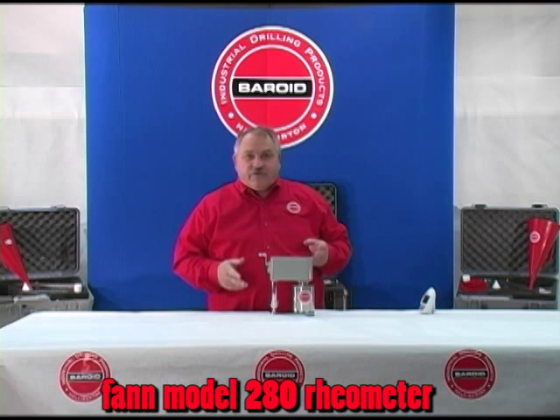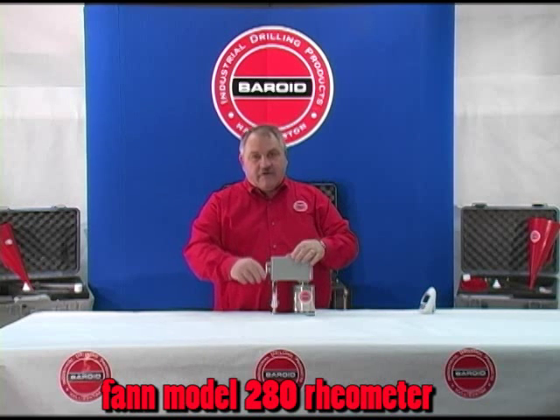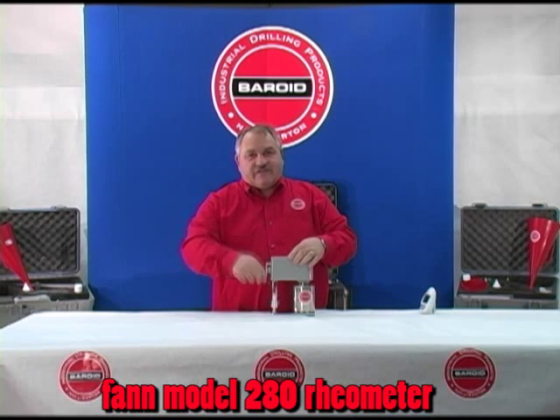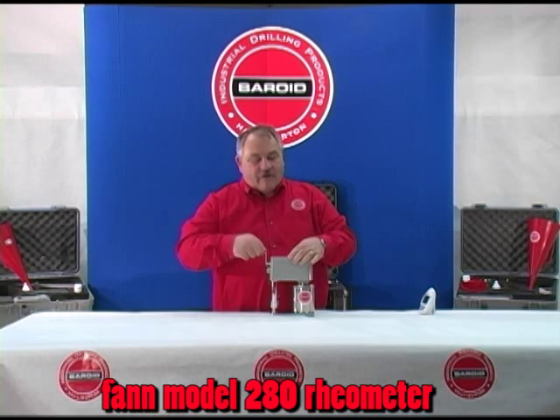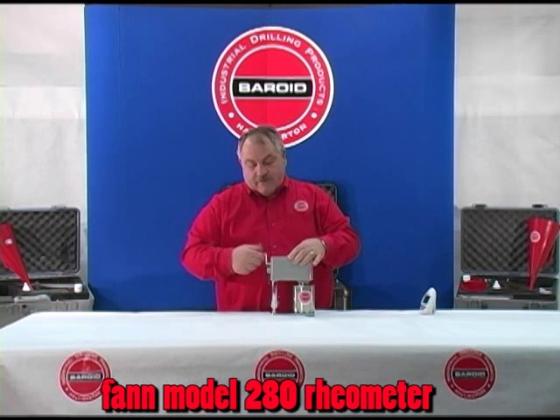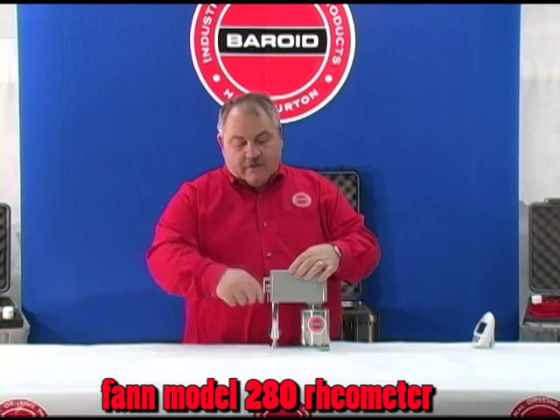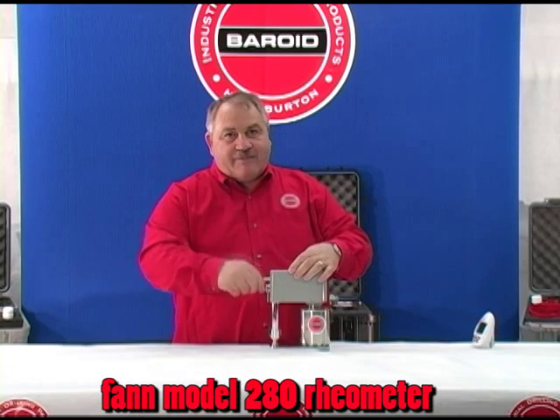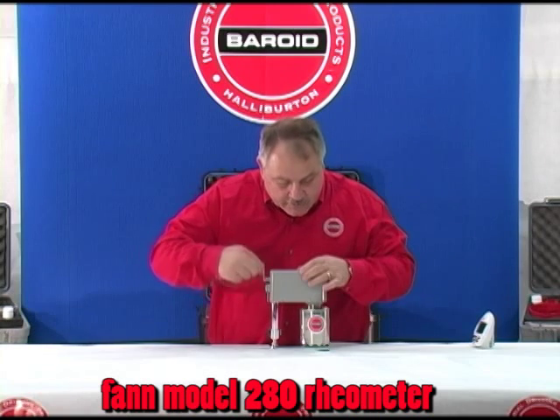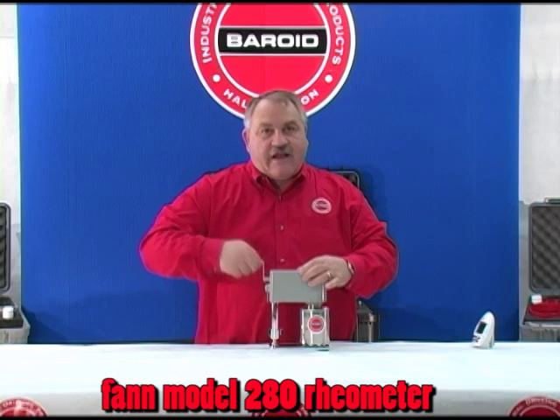The rheometer has several speeds. If we turn the selector all the way down and turn the hand crank, we're at a mixing speed, give or take 1100 rpm. To take our readings, we must set it at 600 rpm. Turn the hand crank — the slip clutch in there only allows it to rotate at 600 rpm. We read the dial deflection, and we have a 28 degree dial deflection.